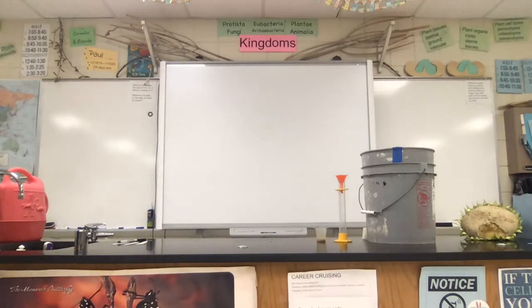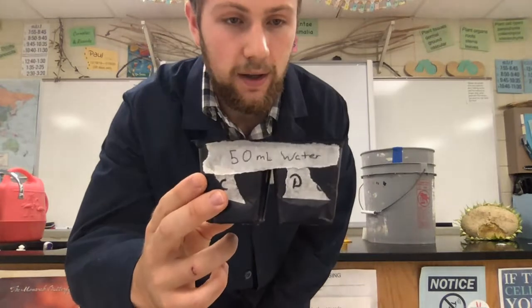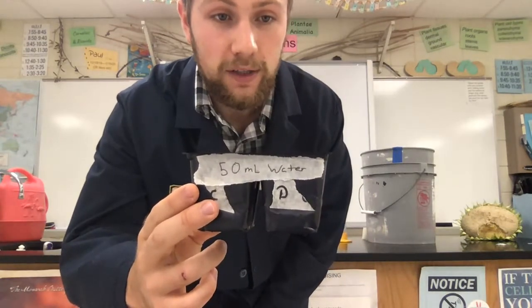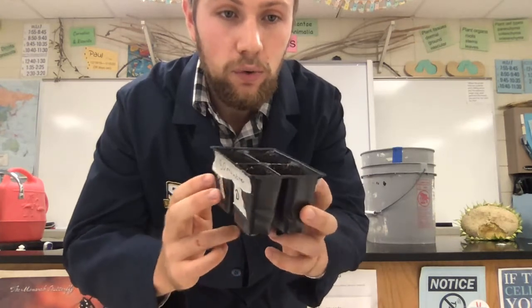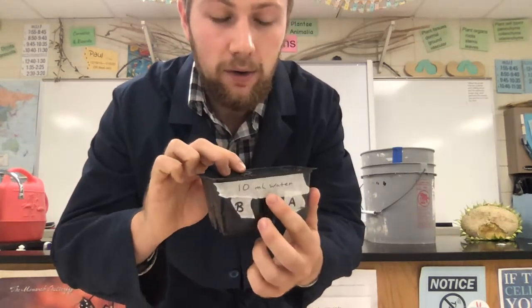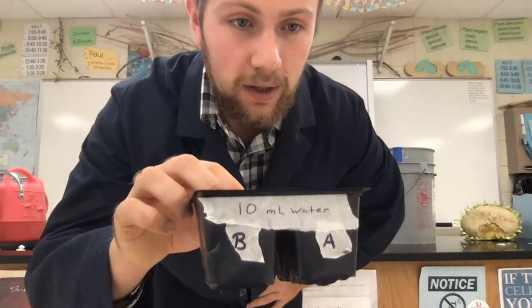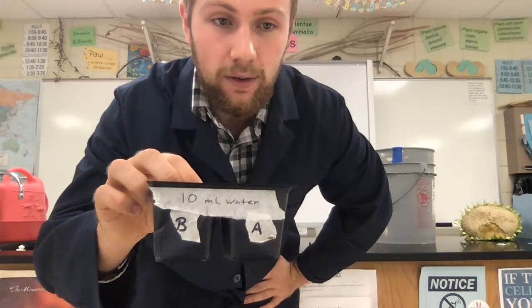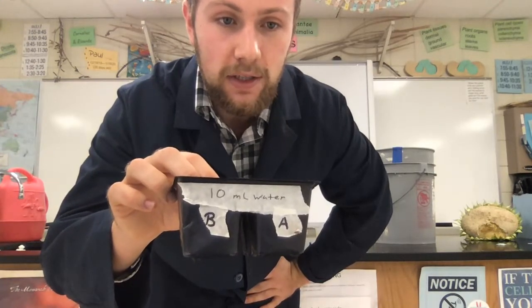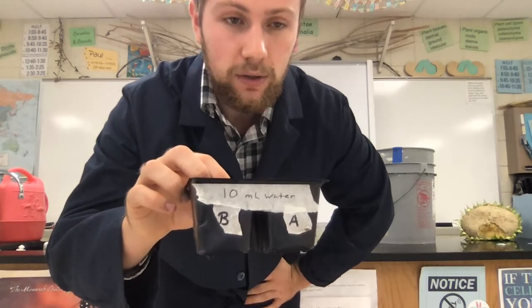So we are going to be planting our tomatoes in one of these 4-quadrant plastic dividers. You will notice on one side of it, two of our quadrants, or our sections of 4, are going to be what we would call our control group. You've noticed this if you've read through the lab, so make sure you read through that procedure, because 2 of our quadrants are going to receive our normal treatment.